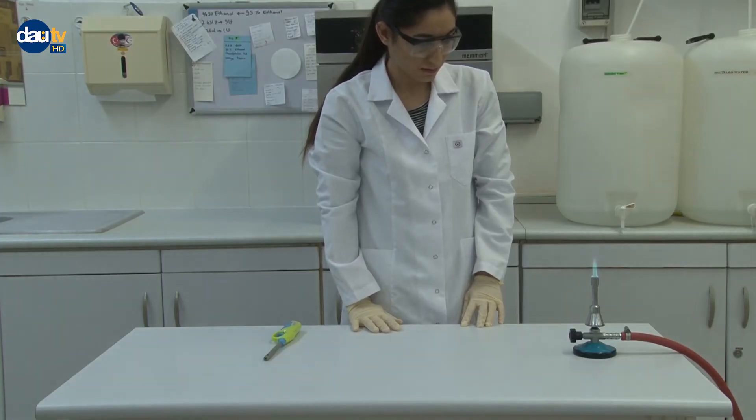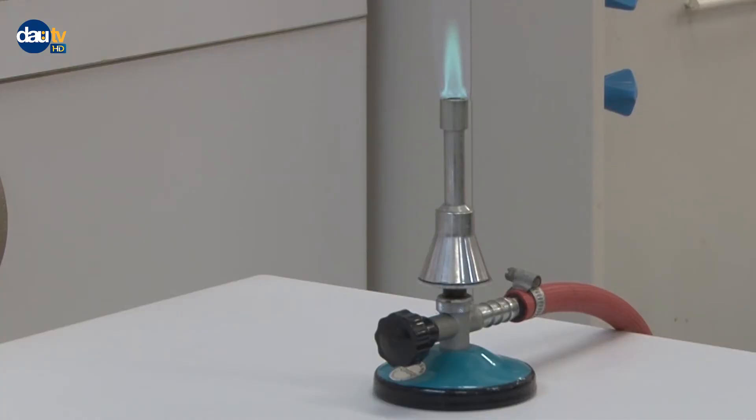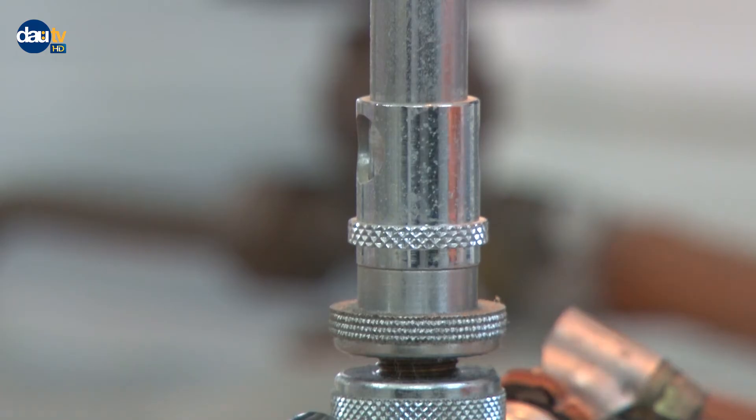The color of the flame will become blue with a shape of a cone as you increase the amount of air by opening the air valve. This blue colored cone shaped flame is the proper flame for heating.